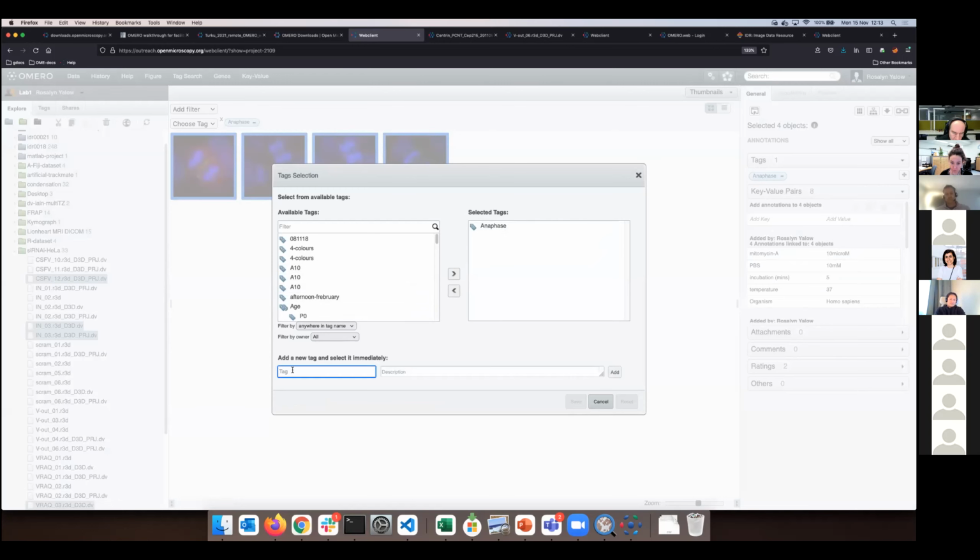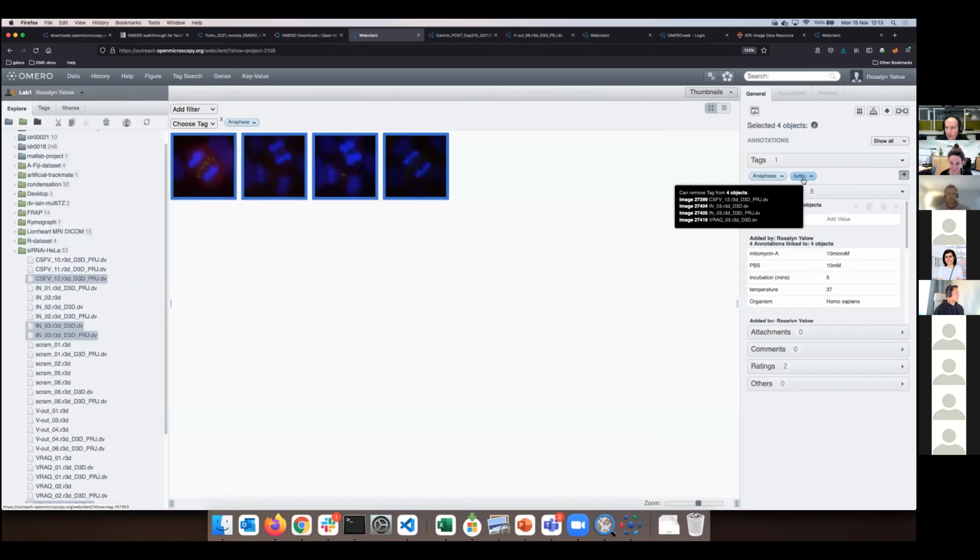You can create a new tag like so, Turku, okay? And then you can add the tag there and you say save, and the tag will appear there. Don't create too many tags, mainly on too many images. And if you create a new tag, then maybe delete it or choose a wild name of the tag so that I can recognize it and delete later.